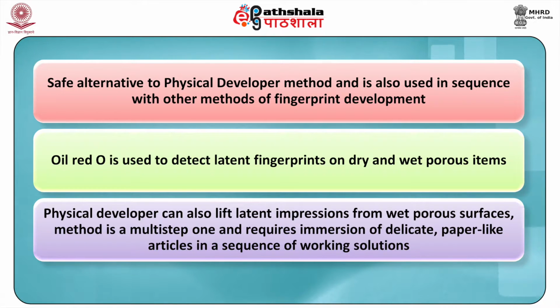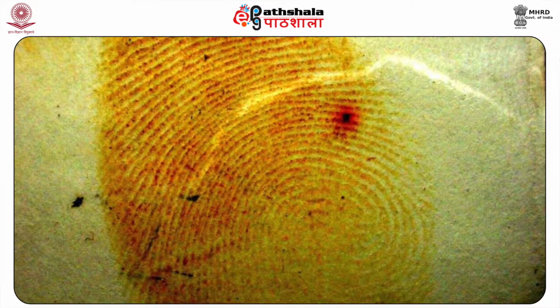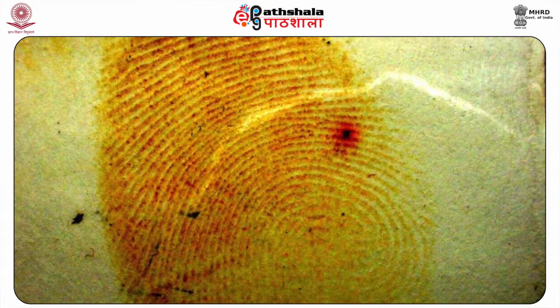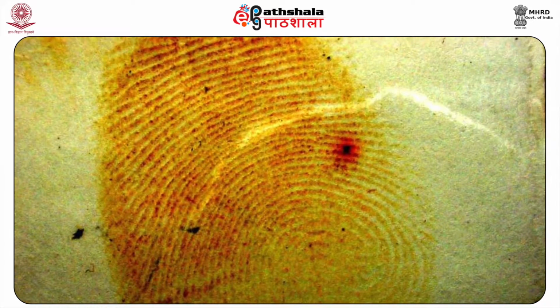Although the physical developer can also lift latent impressions from wet porous surfaces, the method is a multi step one and requires immersion of delicate paper like articles in a sequence of working solutions. Compared to that, the operational steps of the oil red O method are simple. The reagent develops clear, stable, red colored fingerprints which may be discerned in natural light.